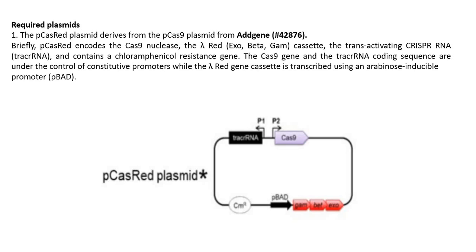So what are the plasmids? If you want to, let's say, arrange a workshop, then you need to complete the process within a week or 10 days. You cannot organize a workshop for like 3 months. When you are using mammalian cells, in my last lecture I told you that for doing CRISPR you have to do selection of clones in the 96 well plate.